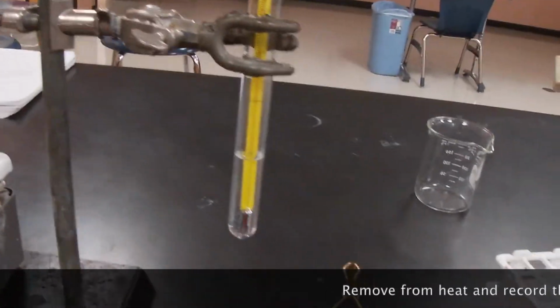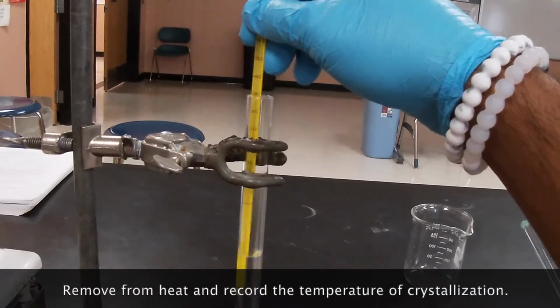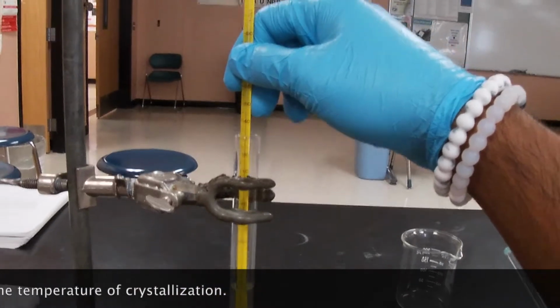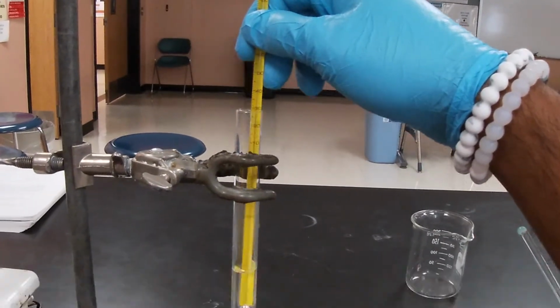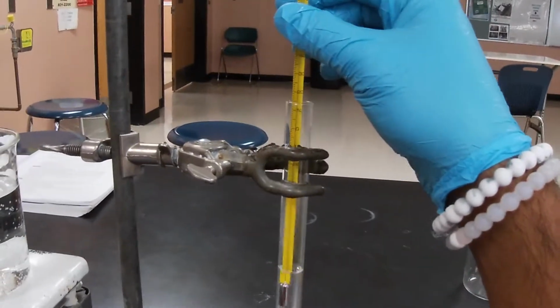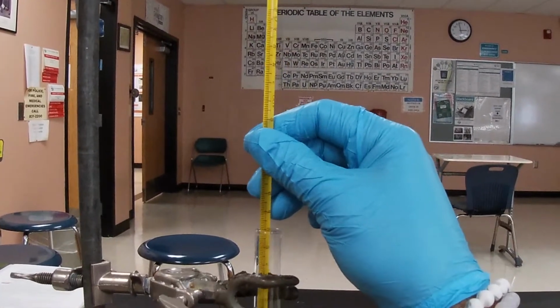So I've gotten it out of the heat, and I'm gonna stir slowly, right, and allow it to cool down. Once we start forming the crystals, we'll notice what temperature we're gonna write down. And so the temperature's dropping.